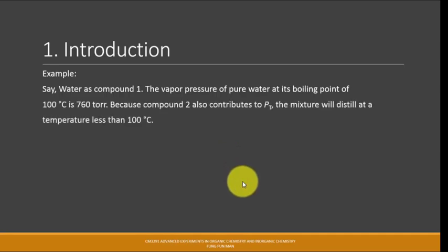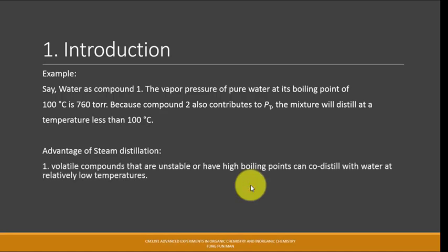Two of them especially I want to highlight. Number 1, the volatile compounds that are unstable or have a higher boiling point can co-distill with water at relatively low temperatures. This process avoids decomposition that might occur at the normal boiling point of the compound of interest.